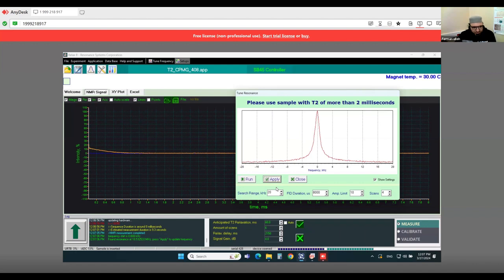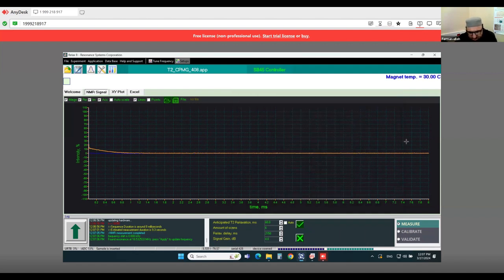So the amplitude, you see here, the density varies from sample to sample. But if it is central, it's okay. So the resonance signal must be in phase. It must be in phase. If it's in phase, then okay, we will proceed further, close and set the parameter.